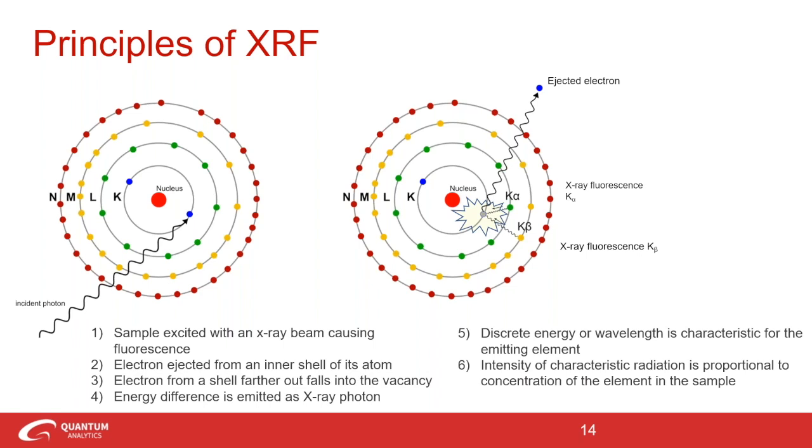The energy of the X-ray is equal to the specific difference in energy between two quantum states of the electron. The measurement of this energy is the basis for XRF analysis. This is the key component.